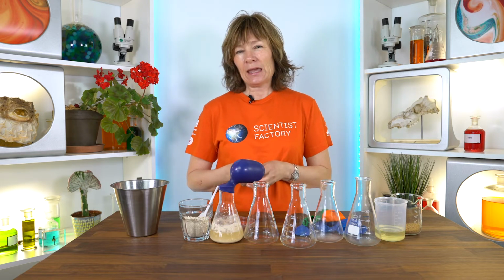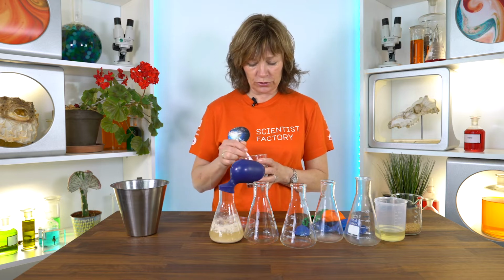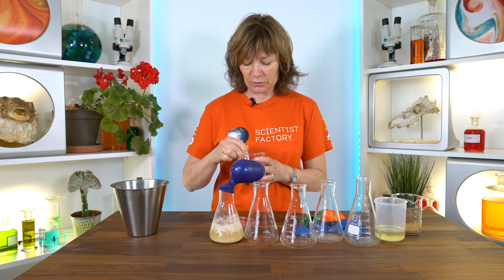In this activity, you will investigate if there is life in a mysterious substance. But as an opening, I suggest that you start by discussing microorganisms. What are microorganisms? Where do they live, etc. And if you have your student's manual, you will find some pictures of different microorganisms there.